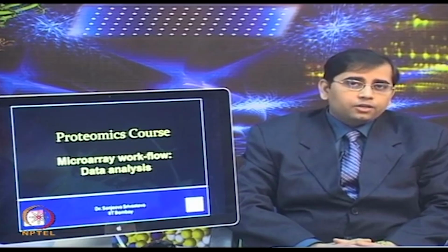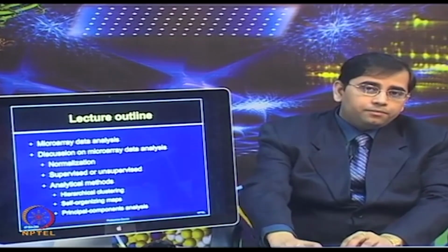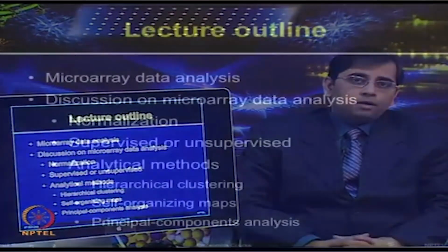Data analysis becomes very crucial to make sense out of the massive amount of data which is generated by microarray based experiments. There are many commercial software as well as free software available, which can be used to analyze microarray data sets. However, any single software package may not answer all the questions related to fundamental genomic or proteomics based questions. So, in today's lecture, we will talk about microarray data analysis.